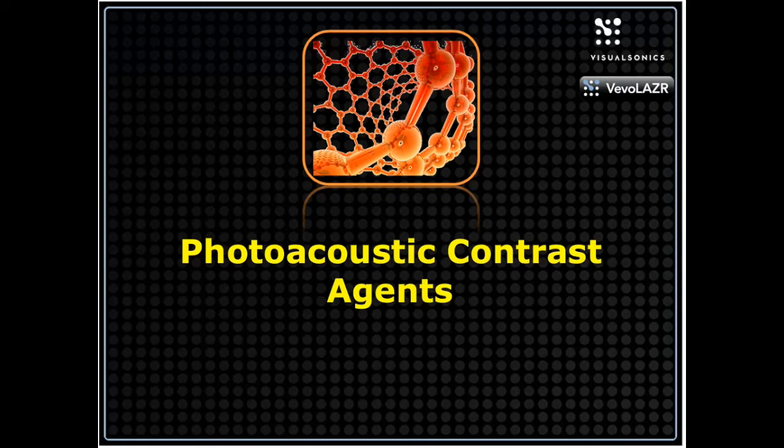Thanks very much, Dieter. Dieter talking about doing some of this molecular imaging gives me a nice segue to talk about contrast agents. For example, in the bacterial infection study, where an antibiotic was attached to an optical dye, ICG, to label infection, and also the reporter gene where you're using melanin as a contrast agent. We can see both of these with our photoacoustic imaging system.